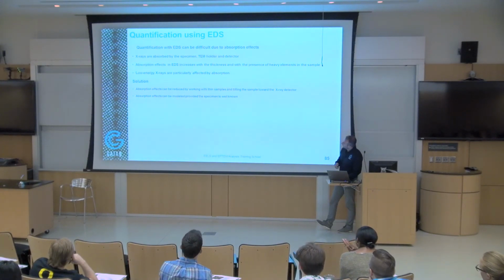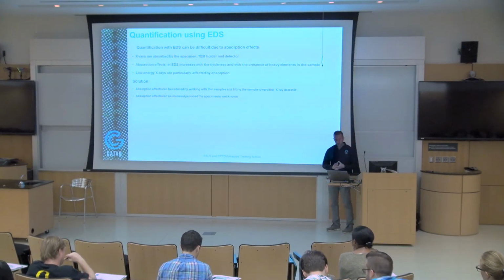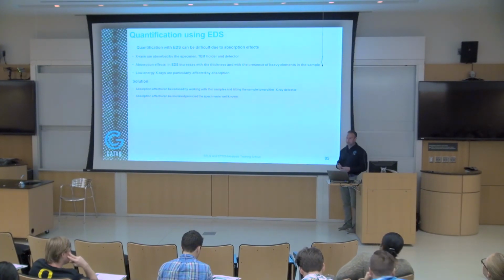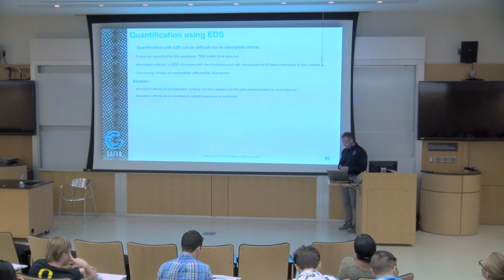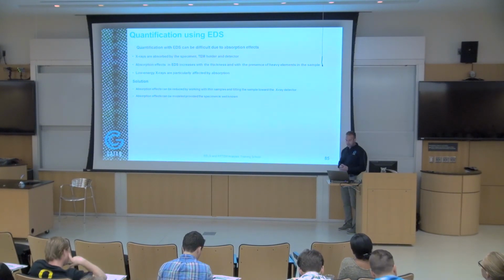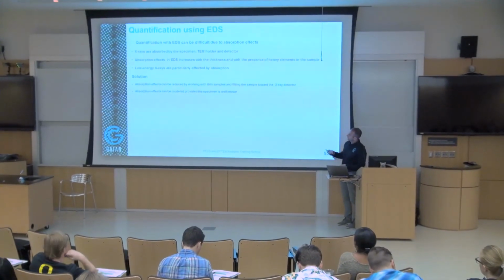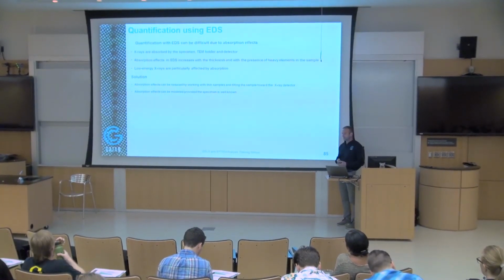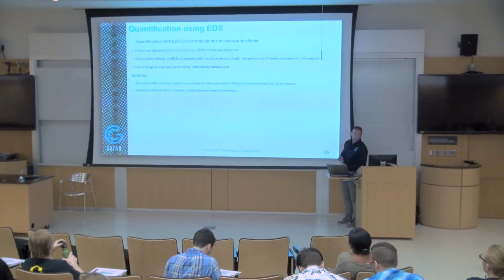Okay, quantification using EDS. The problem of doing quantification with EDS is that you have absorption. Absorption means as the X-rays travel through the sample, they are absorbed. They can be absorbed by the TEM holder, by the detector, or by the sample itself. There's been a lot of development on the EDS side with better, high visibility TEM holders, just to minimize the absorption effect from the holder. And now we are working with windowless EDS detectors, so there's not really much absorption from the detector itself. But the main problem comes from the sample.